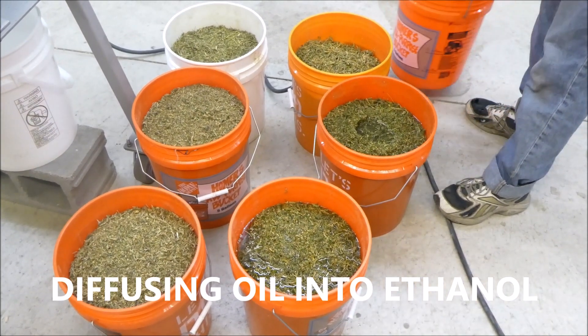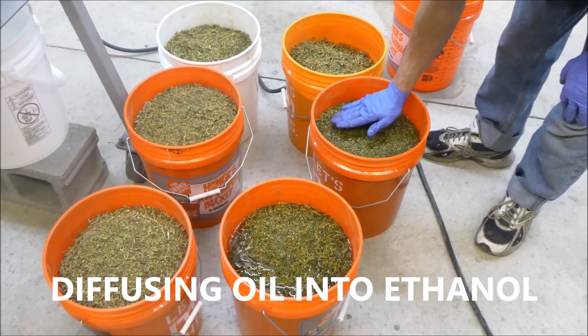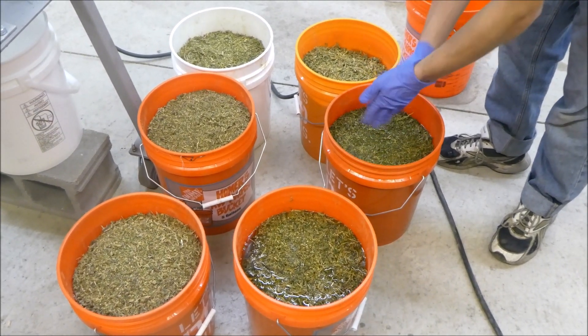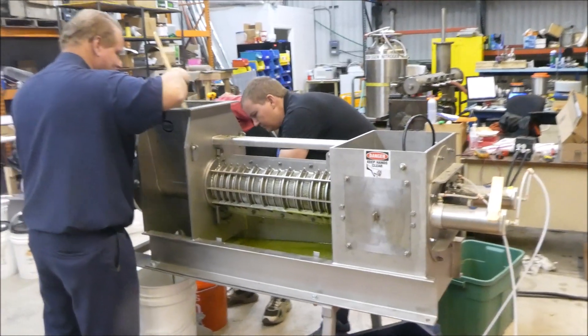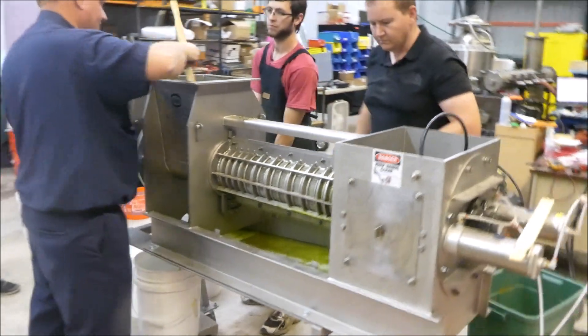So this is Vincent Corporation. We're running a time test on a CP6 press with an 8 to 1 ratio ethanol to hemp.